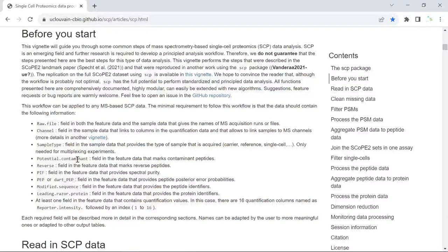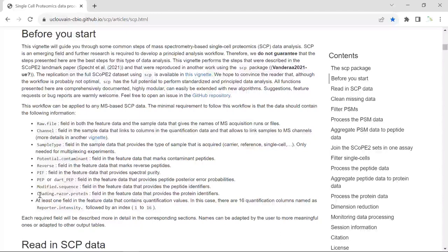The data should also contain information about the quality of the single-cell proteomics data — for example, the potential contamination and the reverse peptide, and also the spectral purity. The PEP and the DART-PEP provide the peptide posterior error probability information. We need the modified sequence information to aggregate PSM data into peptide data, and we need the leading razor protein information to aggregate peptide data into protein data. Finally, we need the columns for the reporter intensity.